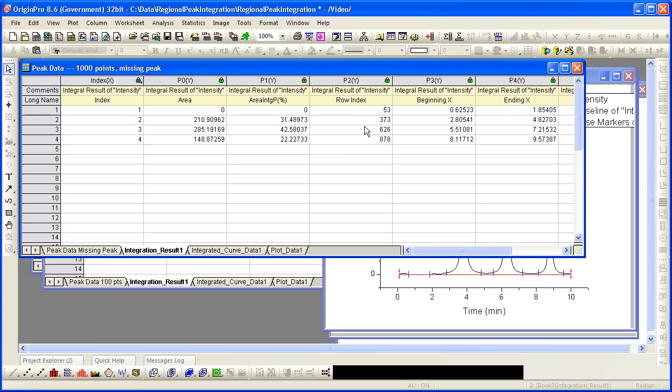So the data is handled correctly and origin with the autofind box unchecked will use the x values for your master or template dataset and apply that to future datasets, which is valuable for certain types of data in spectroscopy or chromatography.